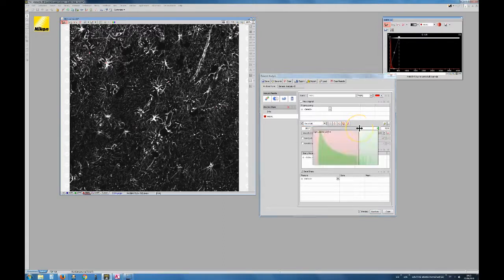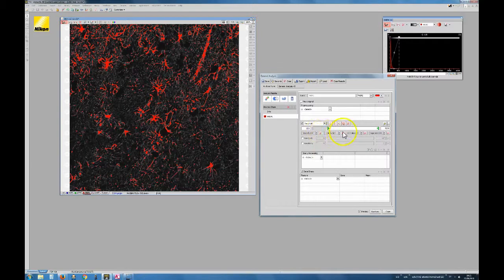And you see that if I slide this now, on the image, you can see that I'm selecting more and more of the pixels. So basically, I am saying now that everything that is above 221 as intensity is considered as signal, and everything that is below is considered as background. So this is a very simple segmentation method called thresholding. And you can see the mask here.